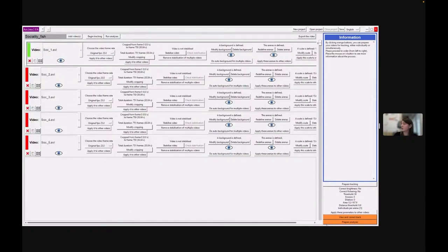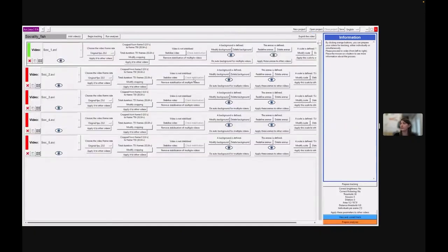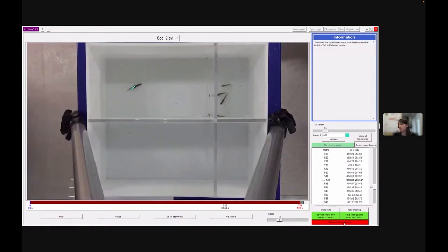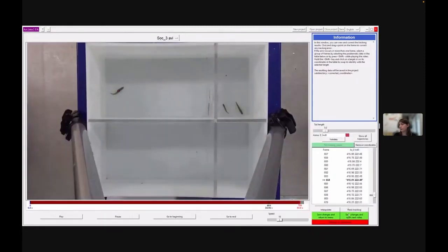I can now have a look at how it went. So here is my first video. The program is telling me that there is no missing value, meaning that it was able to track the fish for the whole video without problem. I can check all my videos like this. So this one has no problem either.